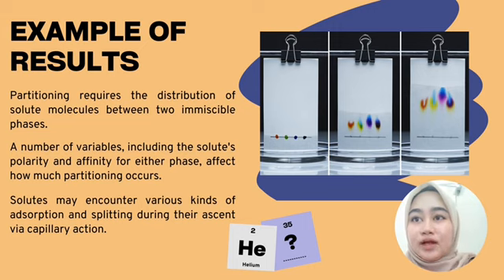Scientists are able to identify new chemicals based on known reference compounds and ascertain the retention factor (Rf) value by examining the migration distance of each component on a chromatogram, which is a visual depiction of separated components.